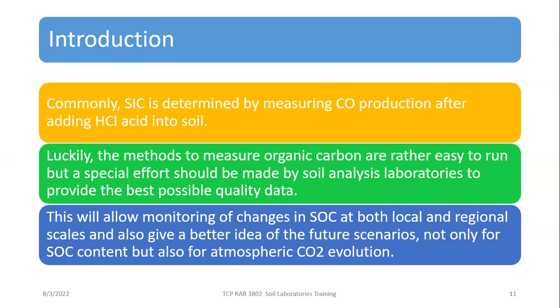As I said, it is very easy. You just combust and ignite a predefined weight of the soil sample, put it in a furnace for 2 hours, and then the loss in weight is attributed to the percent of organic matter in the soil.